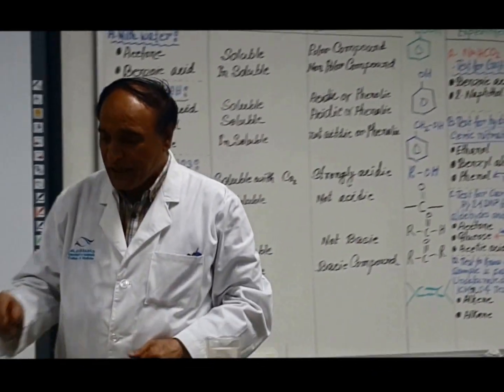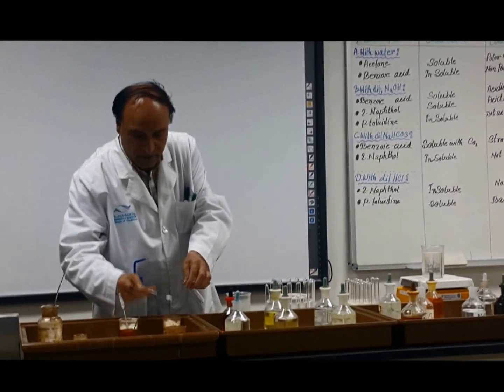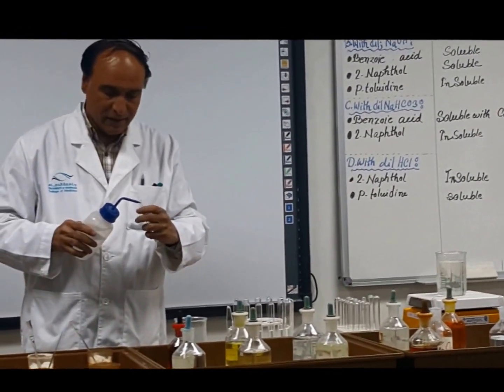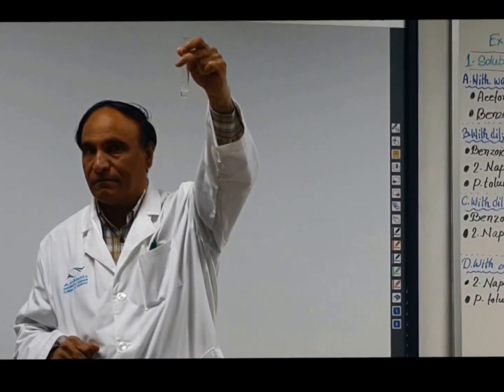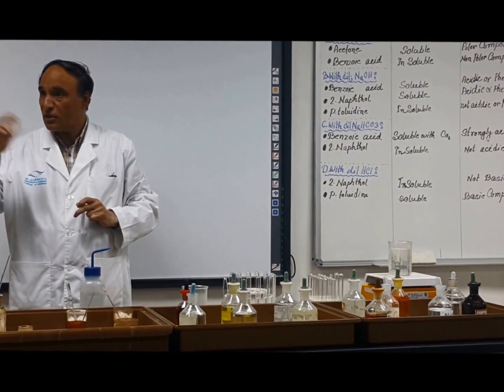So, if I take benzoic acid, a small quantity as I am taking, and I put some water in that, you can see that it is insoluble, it does not dissolve. You should not take a large quantity. You know that sugar is soluble in water.